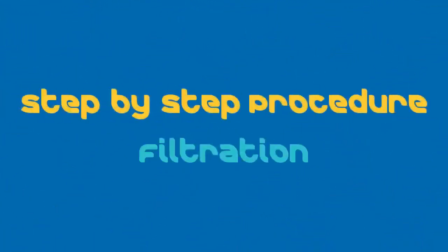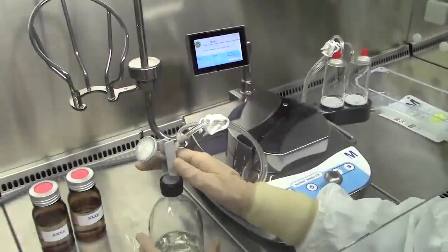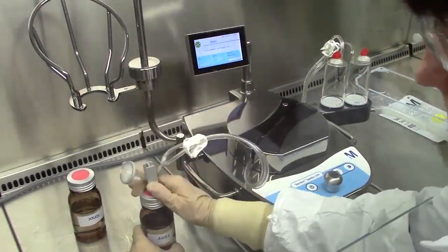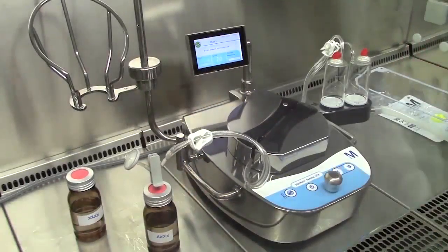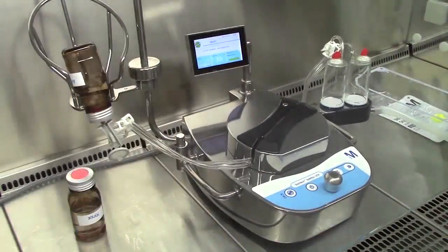At this step, the recommended speed depends on the sample type. If it's an antibiotic or inhibitory product, use a high speed to minimize the contact time between the product and the membrane. If it's a viscous or foaming product, use a low speed to avoid membrane clogging. Install the red plugs. Aseptically insert the tube set needle through the septum. Start the pump. Invert the sample bottle and install it in the bottle holder.